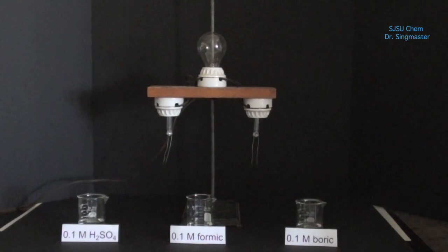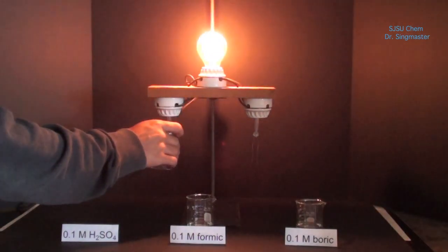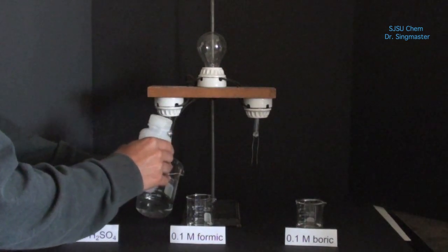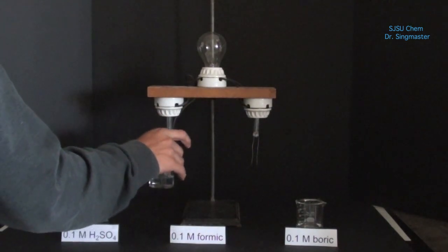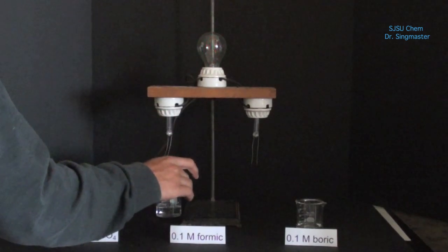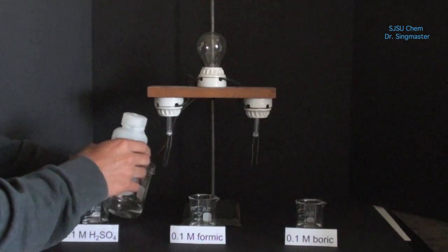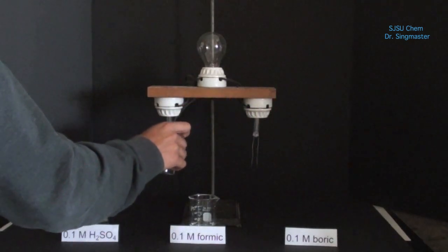We now have three new solutions to test. We're testing a solution of sulfuric acid, the solution of formic acid, and the solution of boric acid.